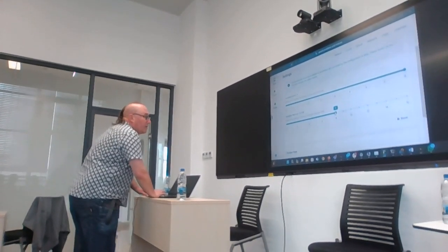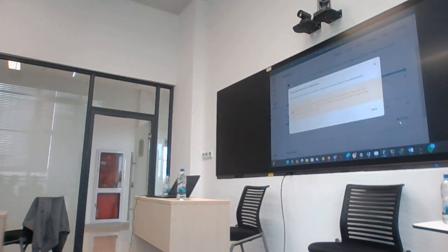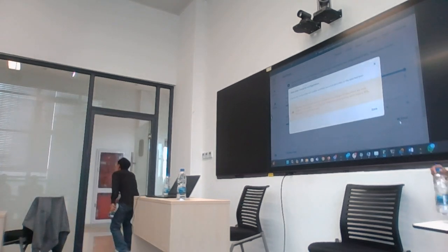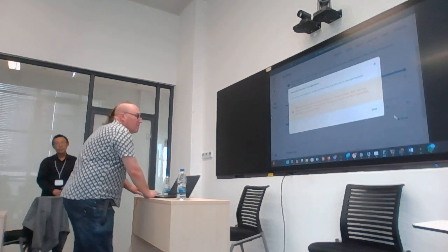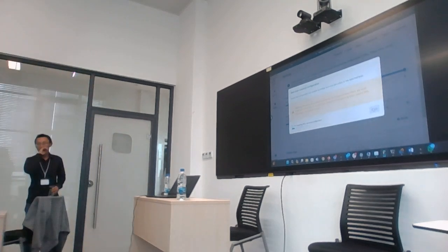I change this thing, okay, and I click save, I get a message. It's going to restart my WSL. That's fine. We don't have anything running at the moment, and you can restart the WSL, okay? Then it goes and restarts the WSL and all of those things, okay? Yeah, for sure.